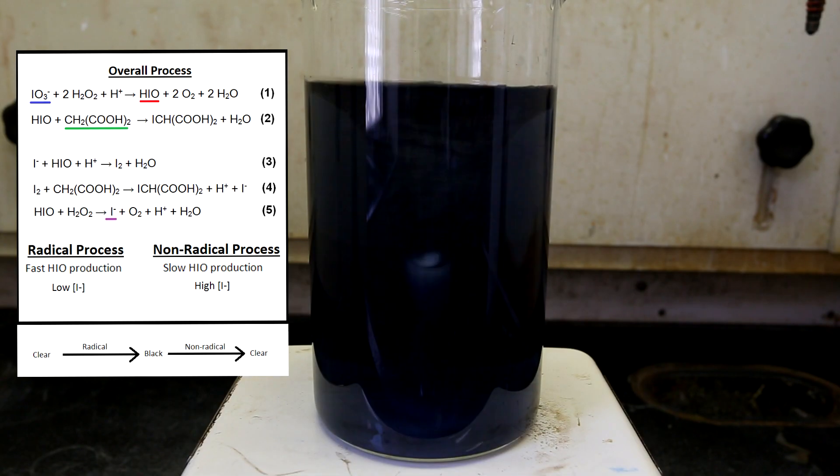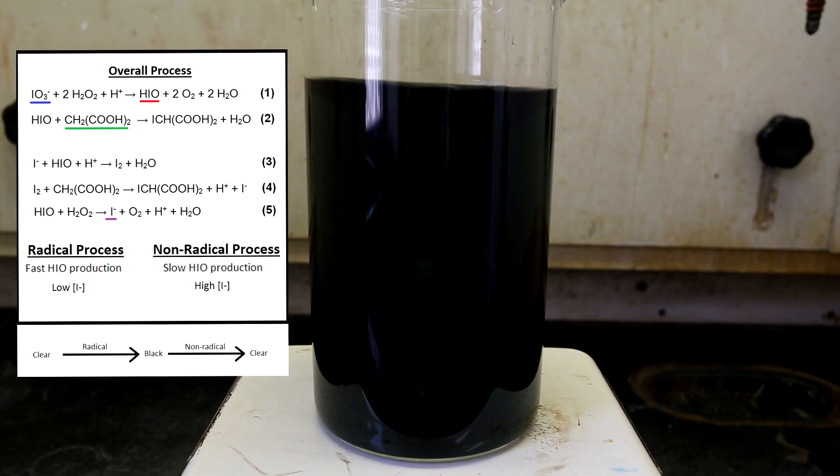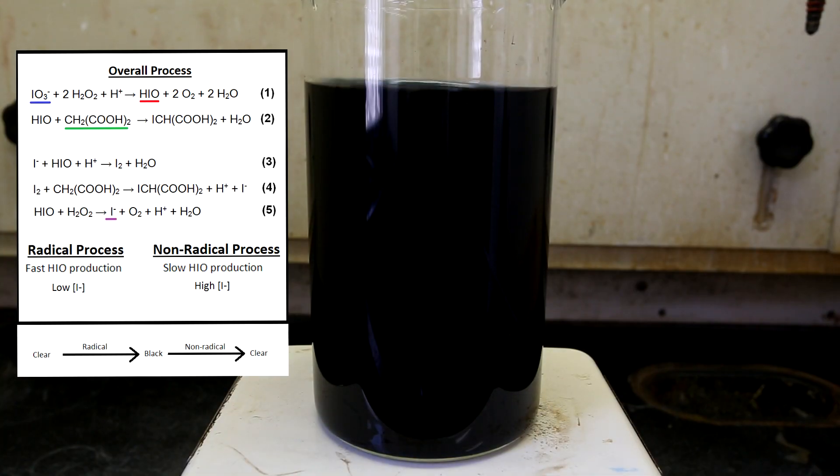I'll quickly explain why the radical process ends. Near the end of the radical process, the concentration of iodide in solution is very high. The iodide reacts with iodous acid, which is an extremely important reaction for perpetuating the radical process. This means that if the concentration of iodide is high enough, it can effectively shut down its own production, which is exactly what it does.